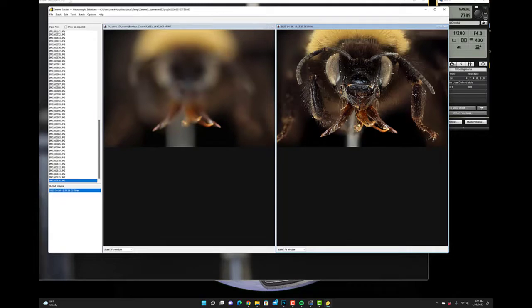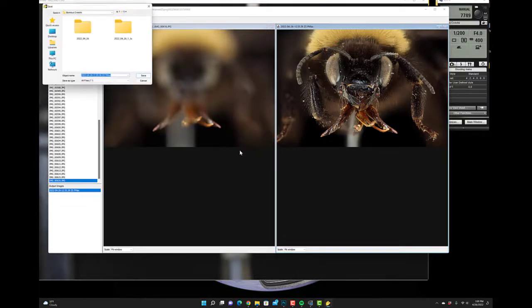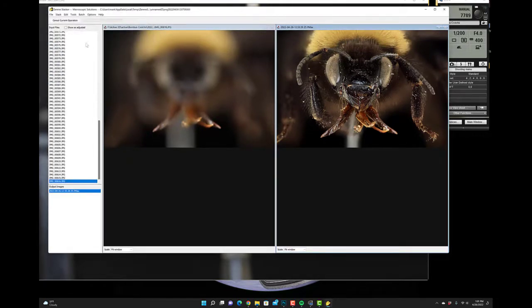Okay, so the first headshot image has been captured. What we're going to do is save the output image. In my case, I'm just going to save this as a JPEG. Save it in the same folder containing the individual focus stacks.